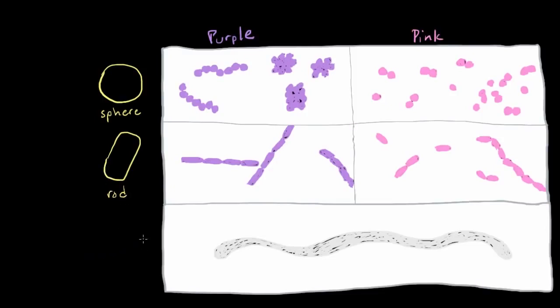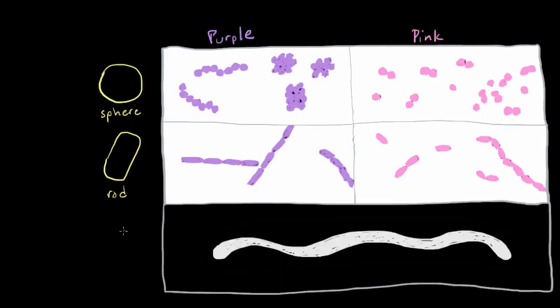And this bottom area I can barely see. So since I've been using a light microscope for the top view, I'm going to use the opposite. It's called dark field microscopy, but don't worry too much about the name. Just basically know that because these don't stain the same way, they have to be viewed differently. And the best thing I can call this is a squiggle. And I hope that makes sense.